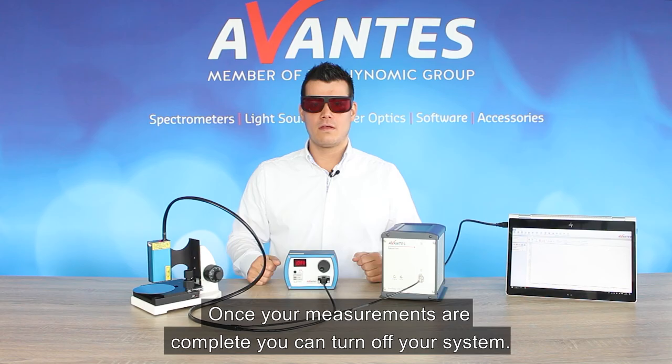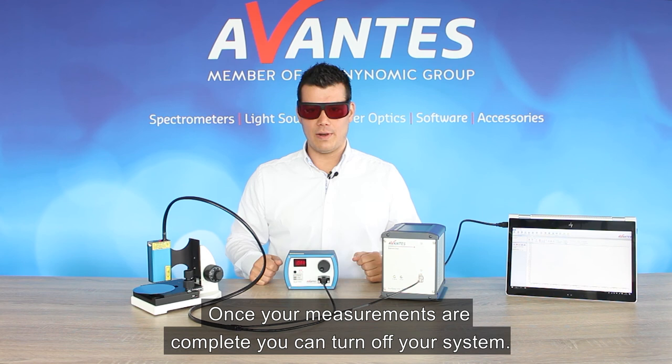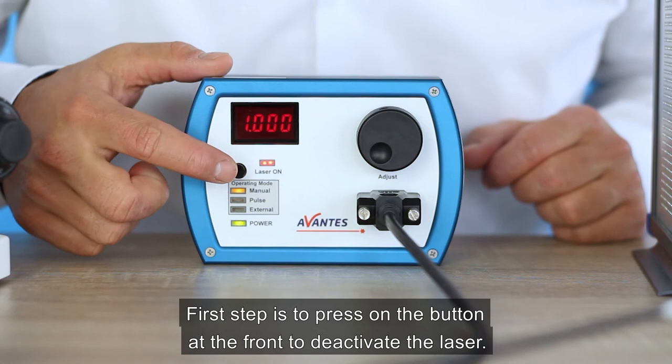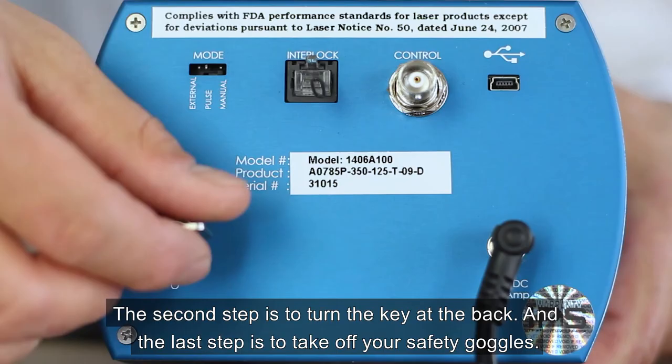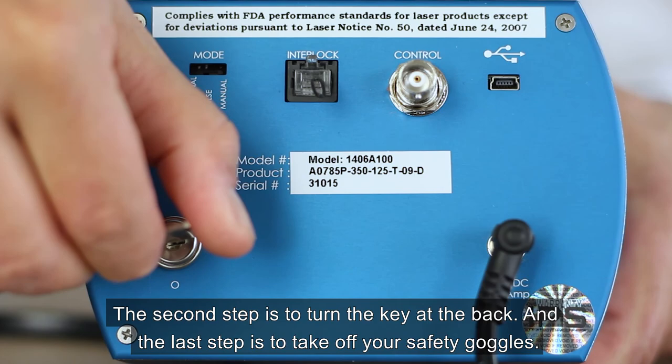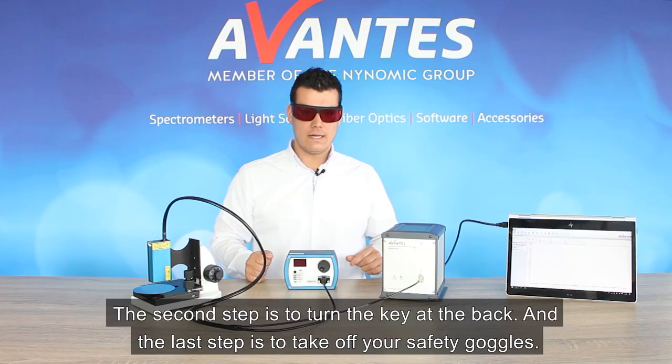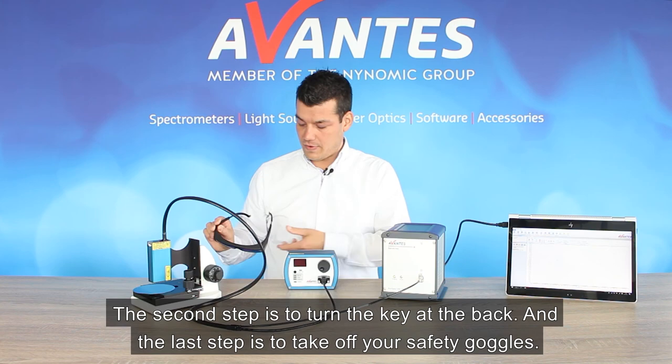Once your measurements are complete, you can turn off your system. The first step is to put on the button on the front to deactivate the laser. The second step is to turn the key at the back. And the last step is to take off your safety goggles.